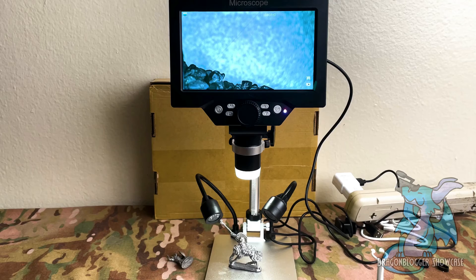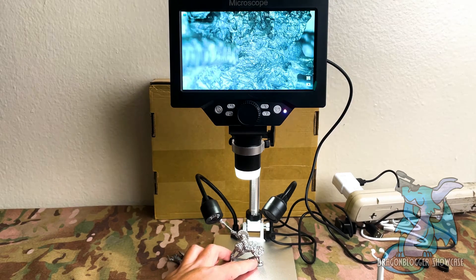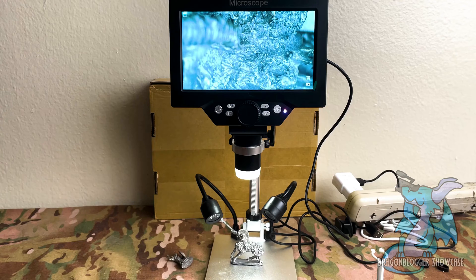Overall, it's very easy to use, definitely very cool, and something that is versatile. You could use it for a variety of hobbies, for biological observations — very versatile in its use and very easy to put together. Thank you all for taking the time to check this out with me, and I look forward to seeing you all next time.